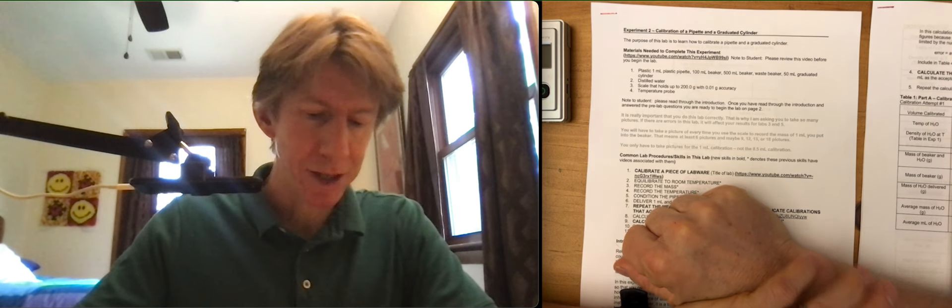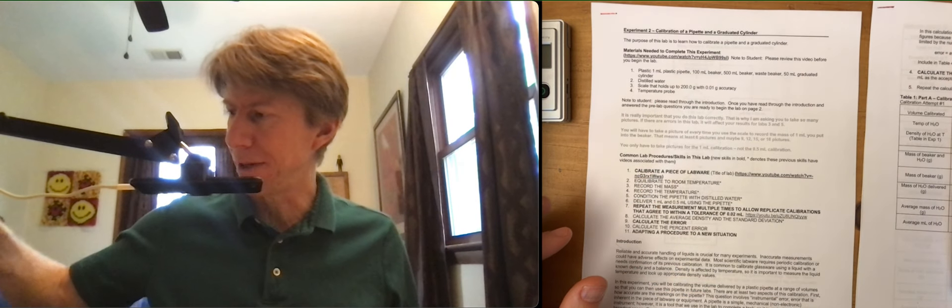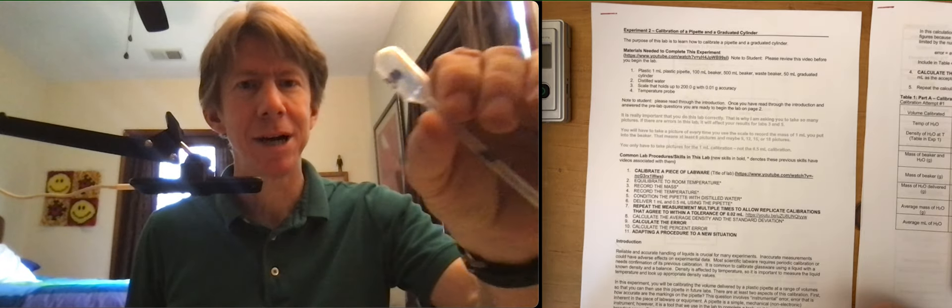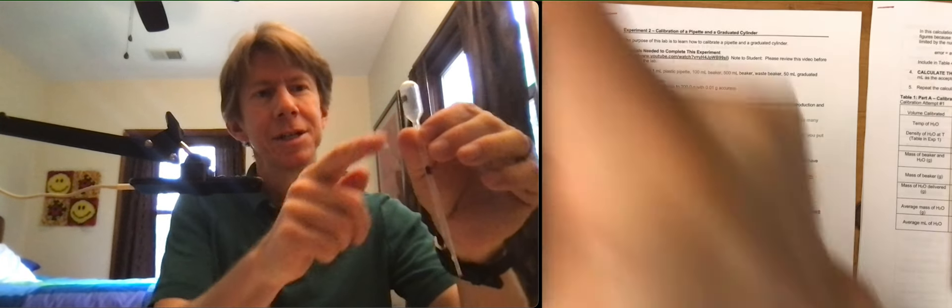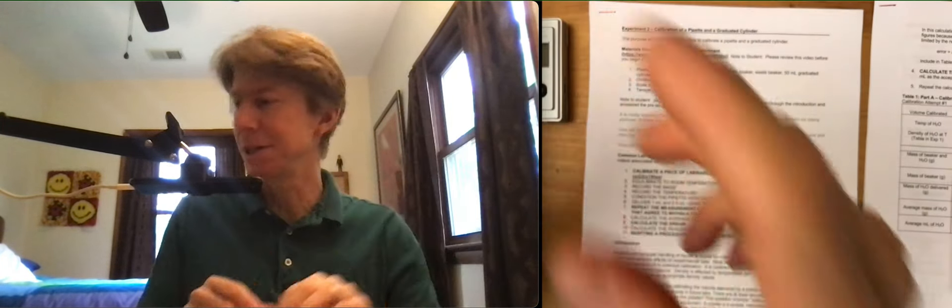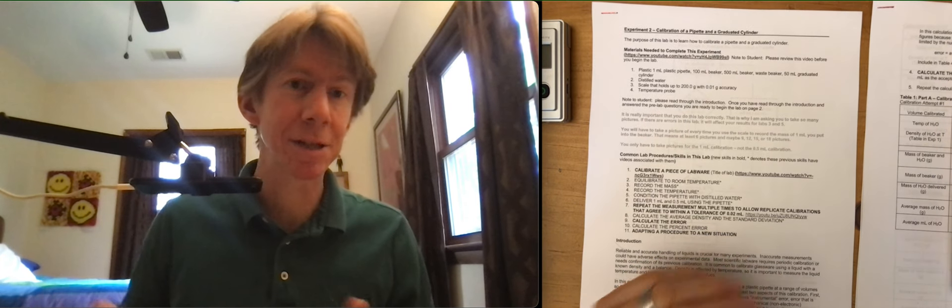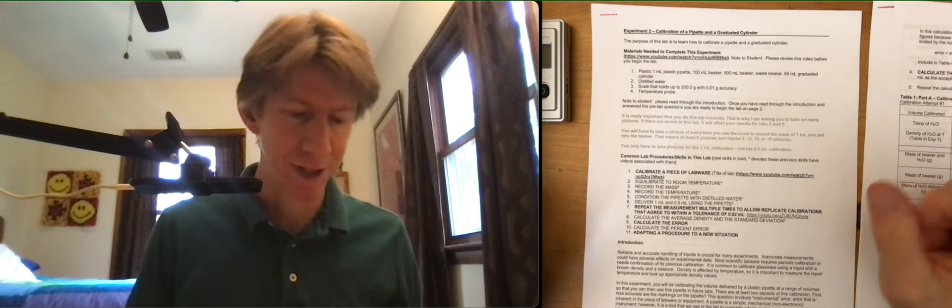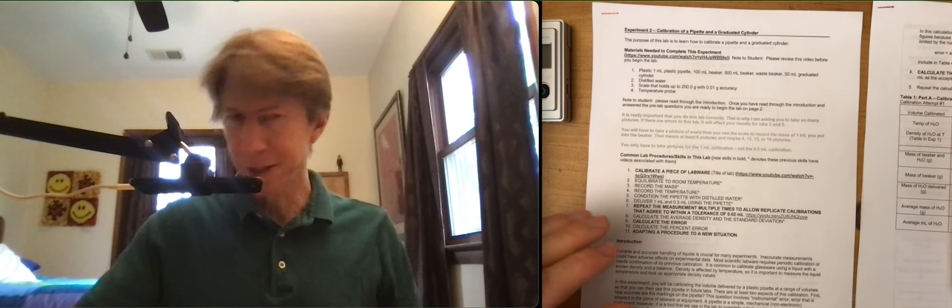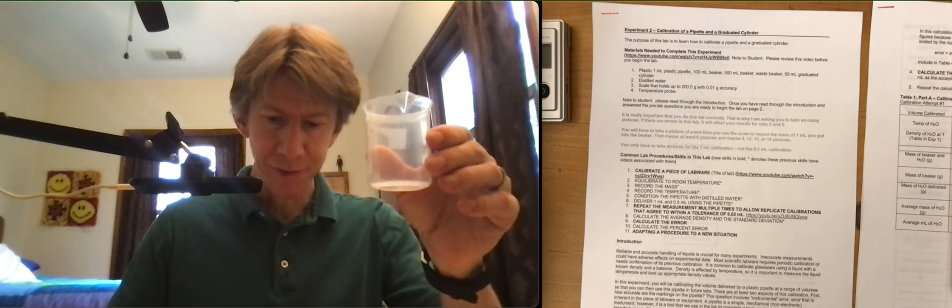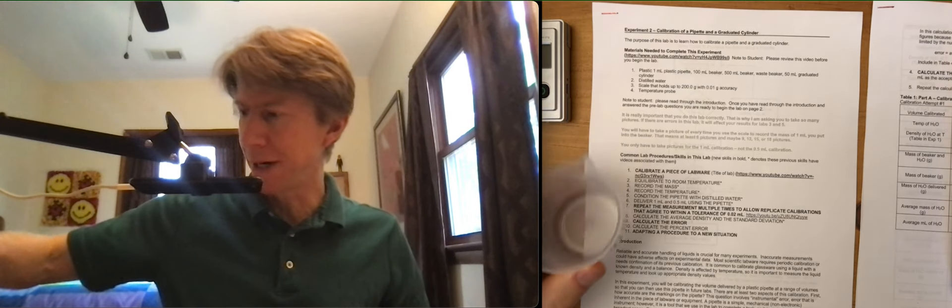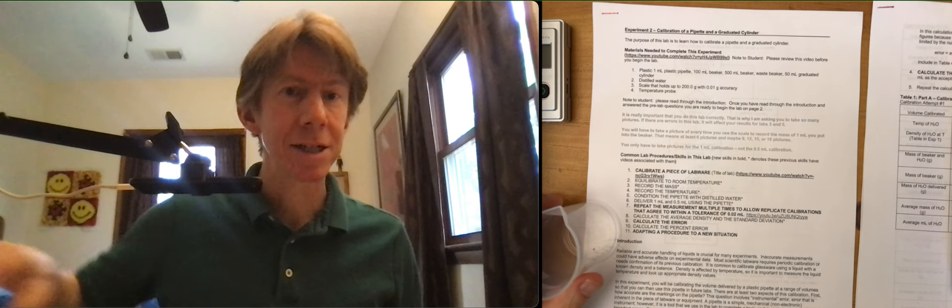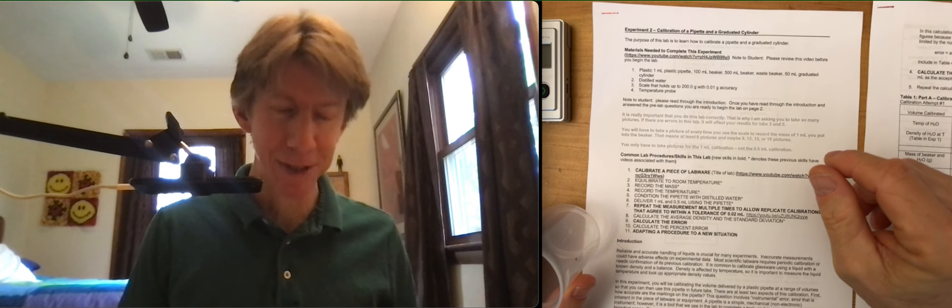The materials you need are a plastic 1 milliliter pipette, and I've got mine right here. I've prepped mine by labeling it with my initials both on the bulb and in the middle. As long as you've got some distinguishing marks on it so that you can tell it apart from the other ones, that's fine. You need a 100 milliliter beaker and a 500 milliliter beaker. My 500 milliliter beaker already has 400 milliliters of water because I've equilibrated it for 15 minutes already.